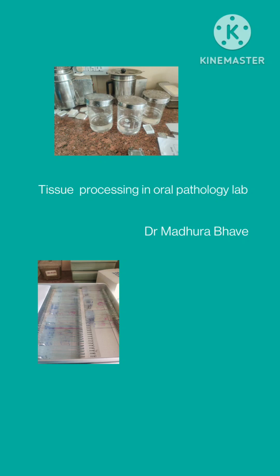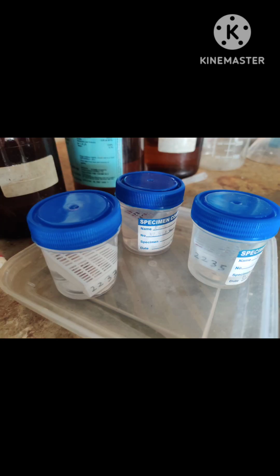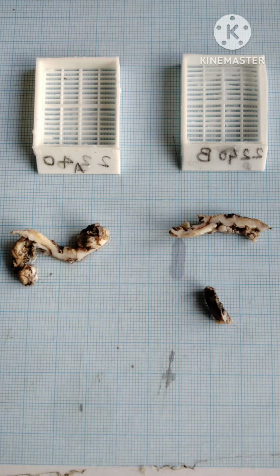So today we are going to see tissue processing in oral pathology lab. So these are the specimen or tissues to be processed. These are grossed and kept over here. This is the grossing procedure. We gross it, take the picture.